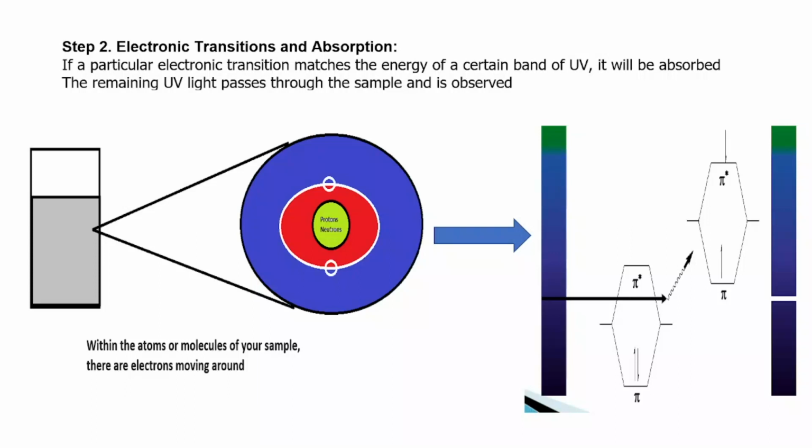you know, from the previous episode, I showed you the electromagnetic spectrum, right? And you realize that each of the radiations has a range of wavelengths that they operate with. It means that when you expose your sample to UV radiation, you are exposing it to a range of radiation that possesses a wavelength ranging from 100 to 350 nanometers. So it's like a group of radiations that builds up that UV band we are talking about.